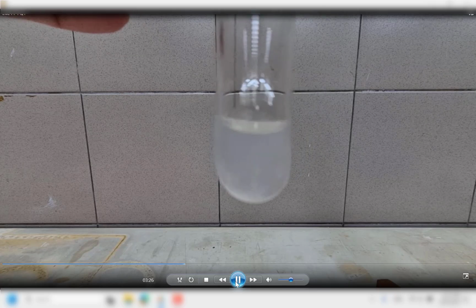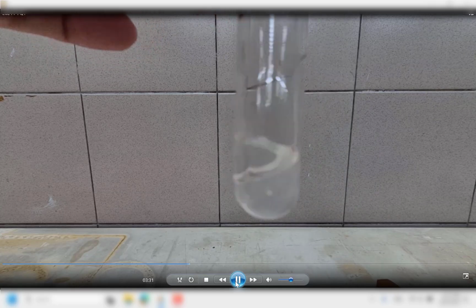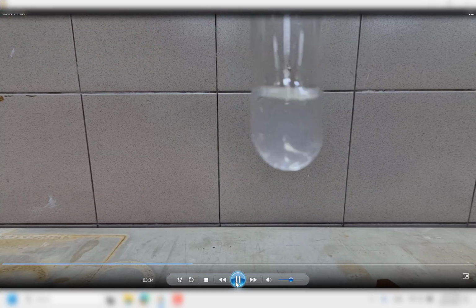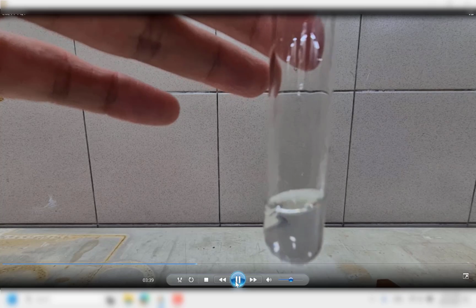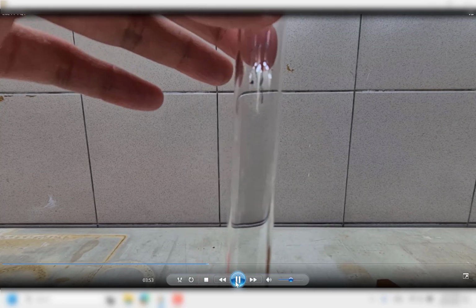So it's colorless now. I add in just a little bit of the dilute sulfuric acid. It's not very clear due to the focus, but I think you can see that the solution is a little bit cloudy, so that's white PPT appearing. I think it's quite obvious now. And then now I add in a little bit more. I think part of it dissolved already, or most of it dissolved. But just now you do see the brief appearance of the white PPT. So I think that's good enough. Those are the two things you need to record: white PPT reappears, and then dissolves in excess sulfuric acid.